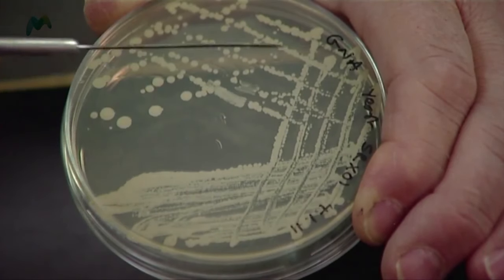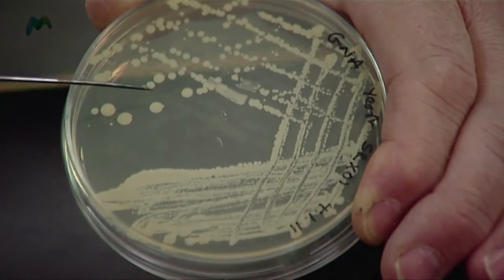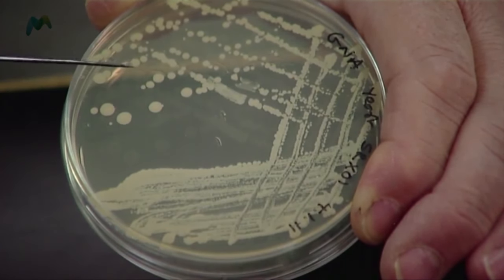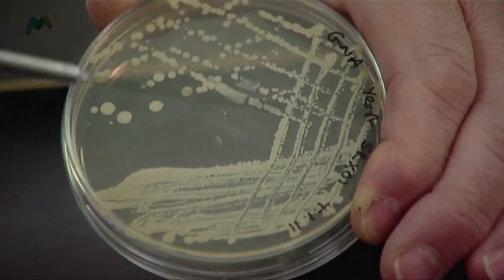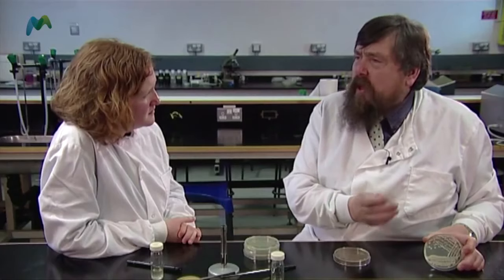I've got some cultures that I streaked out before. If you look at this culture, you can see it's been streaked out, and around here we've got colonies — each one of those colonies has derived from a single cell. If you look carefully, they all look very similar in colour and size, and we can make a good estimate that it's a pure culture.